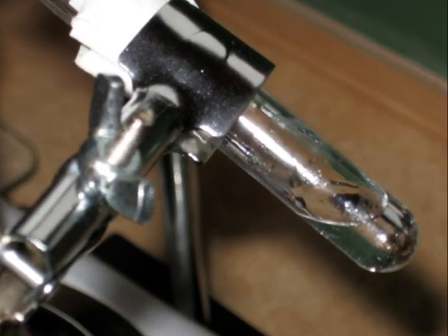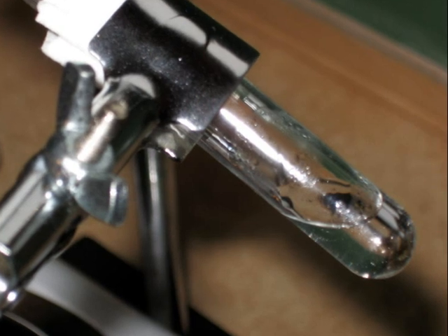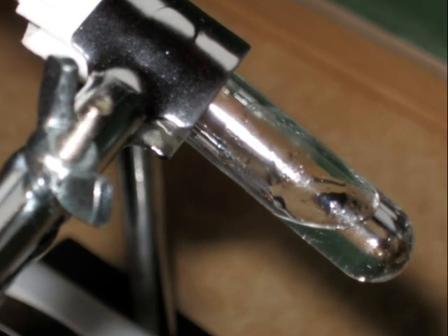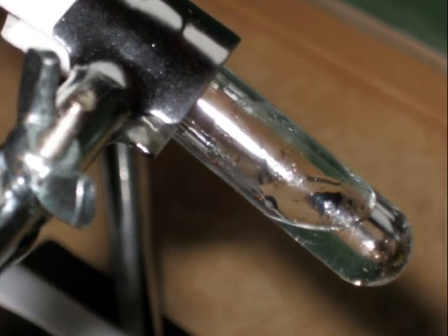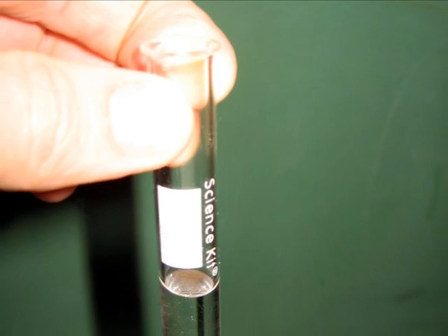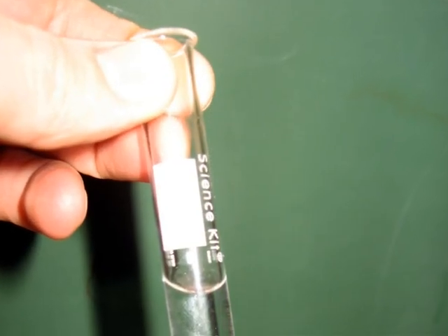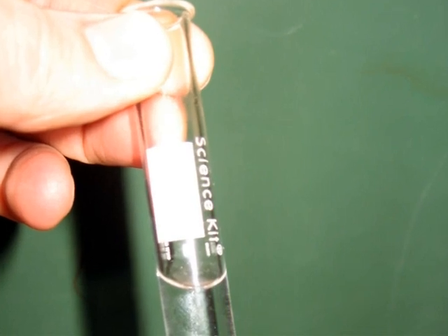Once you've collected your essential oil in the test tube, be very careful because it'll be hot. Use safety precautions such as a mitt or tongs. Your essential oil should be clear. After it is cooled and is easy to handle, you can evaluate your work.